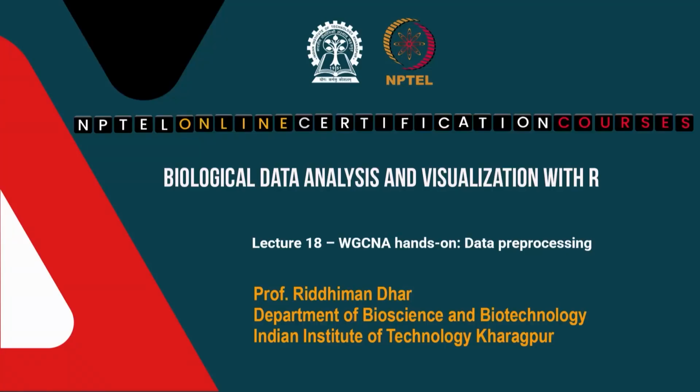So, we have introduced WGCNA and we have talked about the WGCNA package in the last class, and we have also introduced the data set, and we have talked about how we process the data set with metadata and gene annotation. So, what we will do is we will continue that analysis now in this class, and we will go into more detailed analysis.